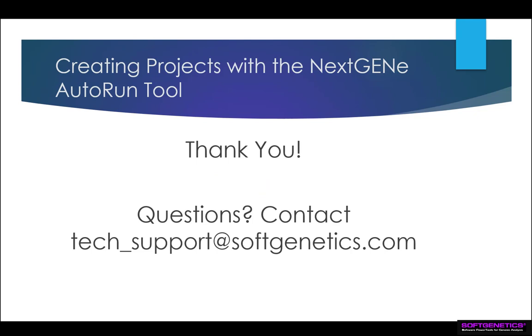Thank you for viewing this webinar on using NextGENE's AutoRun tool. We've discussed how to save your settings files to be used with the AutoRun tool and how to set up AutoRun jobs for new projects or to batch export reports for existing projects.